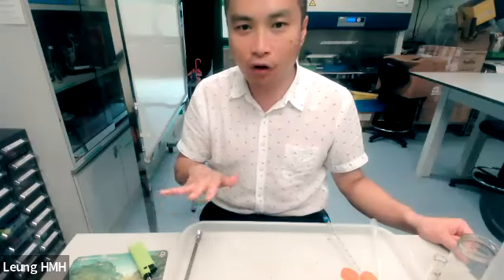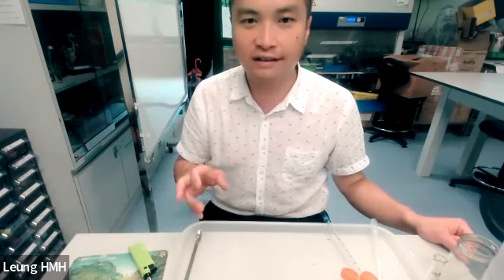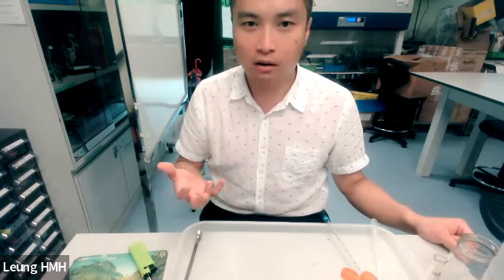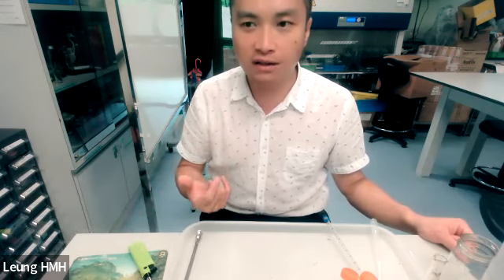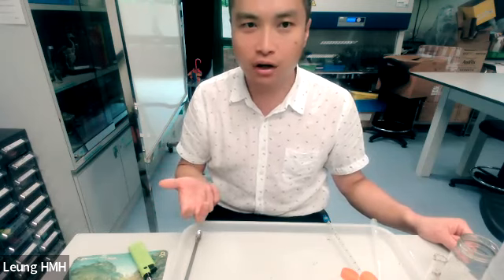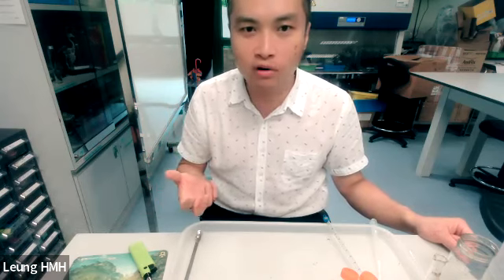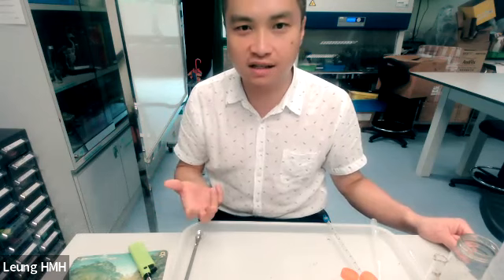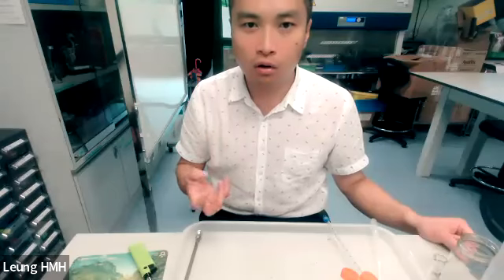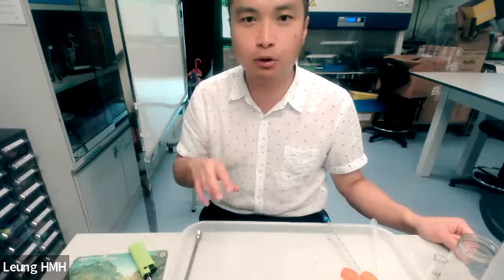So this is the first part of the experiment on transesterification, and this is the basic concept for the reaction. This reaction cannot represent the true situation, because in the true situation we have many difficulties to overcome, such as the components of the ingredients, the purity of the ingredients, and the amount of methanol used, which may change from time to time.